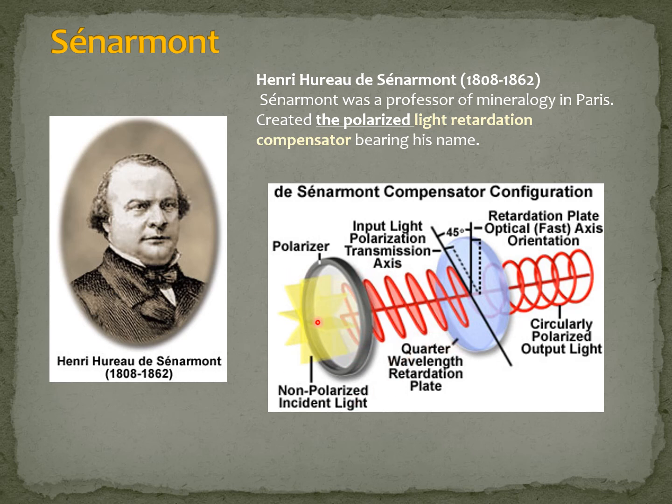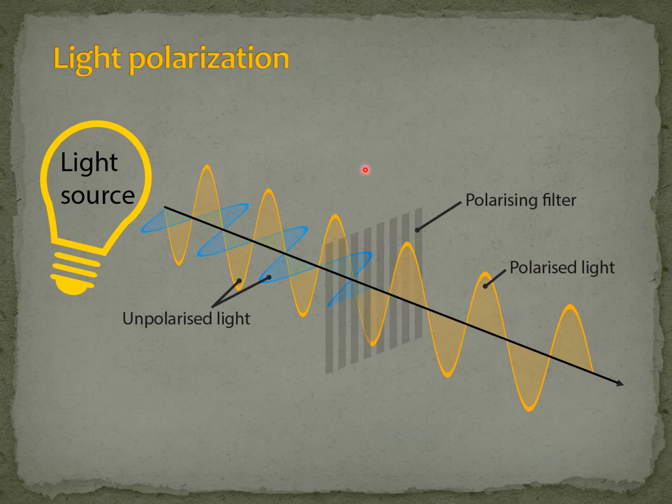They can come in different types of rotations, and Nicol also in the 19th century was capable of appreciating that problem and created a polarizer that basically is capable of cutting most wavelengths except the ones that come in the same direction. This is better seen in this slide.